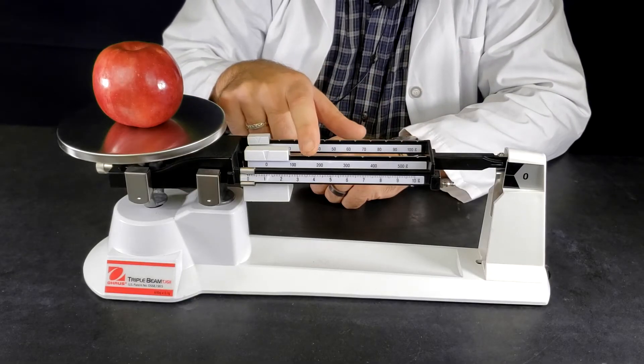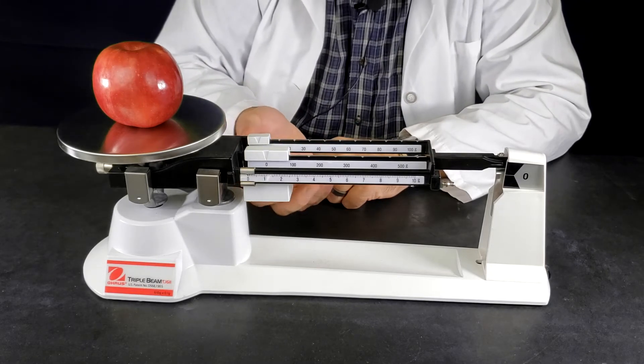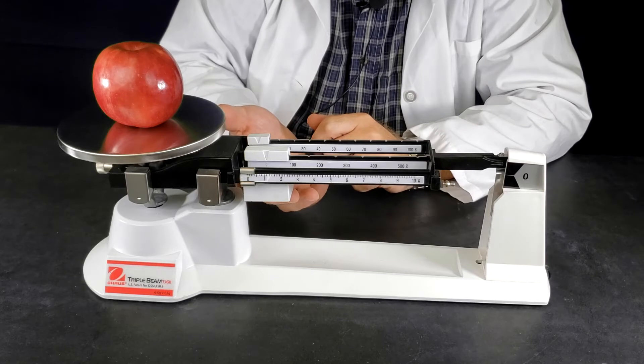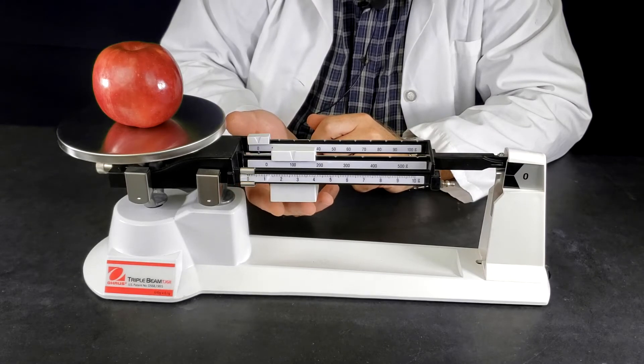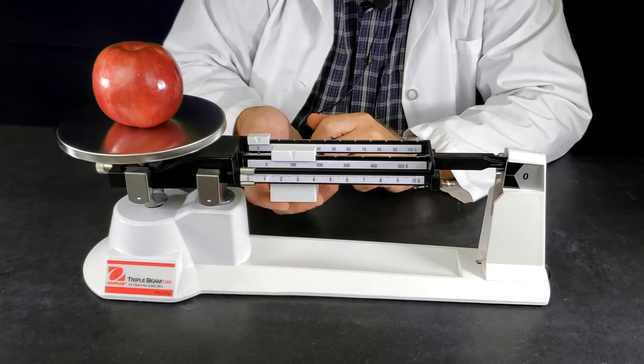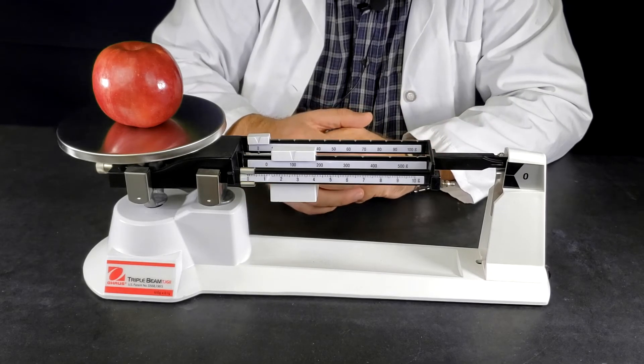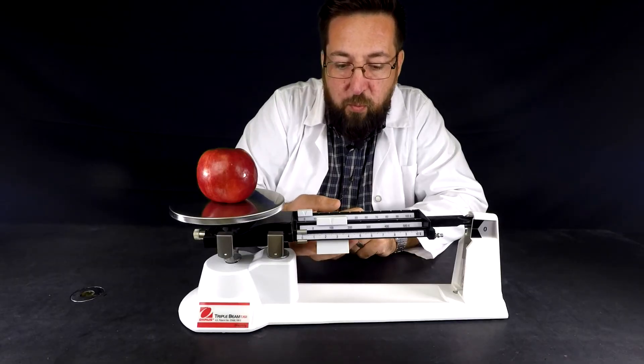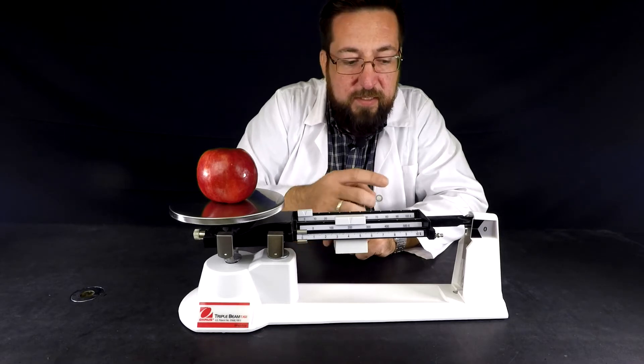Now notice that there are notches in the rider bars and I have to make sure that my riders fall into the notches and you can feel it and hear it when you use one in real person. So I just moved it to 100 and notice that the pointer did not go down. That means that my apple has a mass greater than 100 grams. If I move it to 200 it still hasn't gone down so I know that it's more than 200 grams.